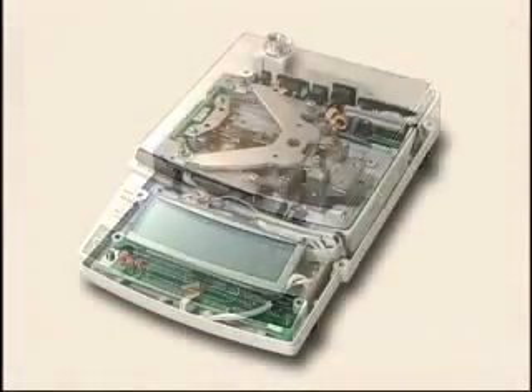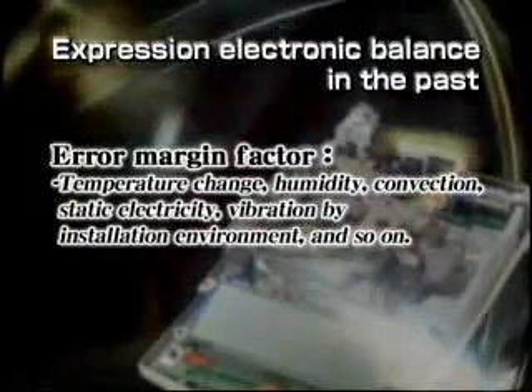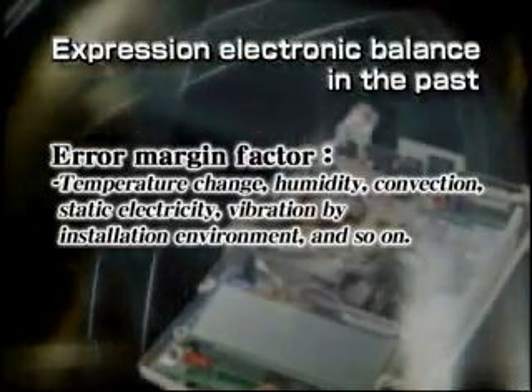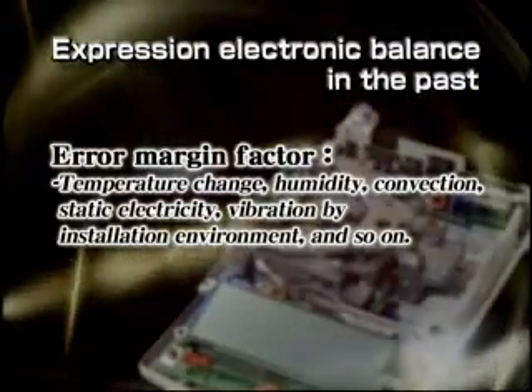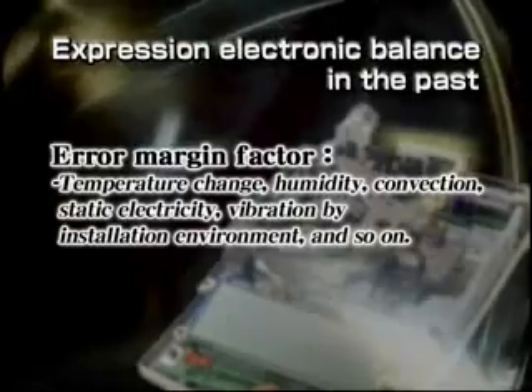This is what the inside of an actual electromagnetic balance looks like. A large number of fine precision parts are used to improve accuracy. That's why even the smallest thing can cause performance to change, ruining accuracy. Moreover, temperature fluctuations inside the balance itself, the temperature distribution between internal parts, or environment-related issues such as temperature, humidity, convection flow, static electricity, or vibration can result in errors.